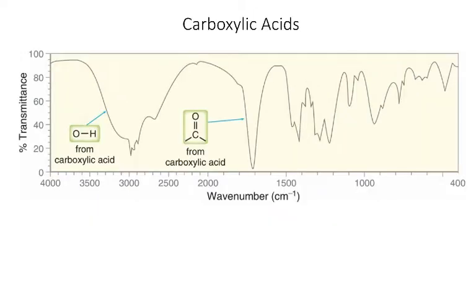All right, similarly, carboxylic acids are very recognizable. When we have a hugely broad peak centered around 3000 wave numbers, that's almost certainly a carboxylic acid. And sometimes people describe this as a hairy beard, right? Because where the carboxylic acid OH stretch overlaps with the CH stretches, we get the hairiness of the broad peak. And also, carboxylic acids not only have the OH, but they also have the C double bond O, right? We're also going to have a carbon-oxygen double bond. It's going to be a very intense peak in this double bond region of the spectrum, in this case a little bit more than 1,700 wave numbers.